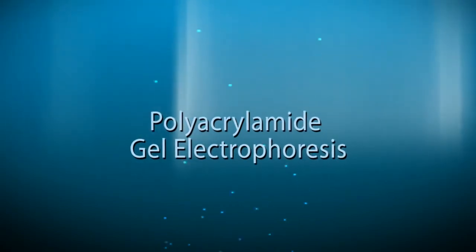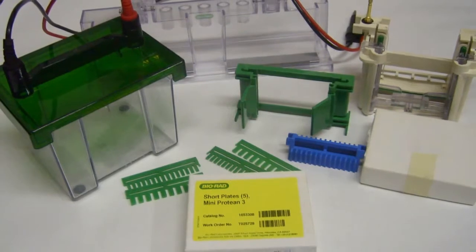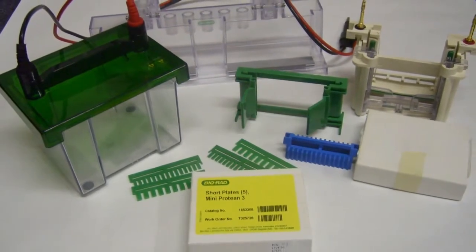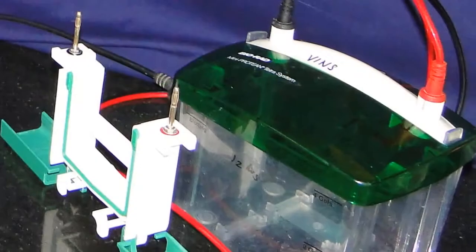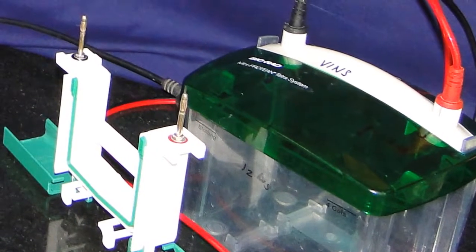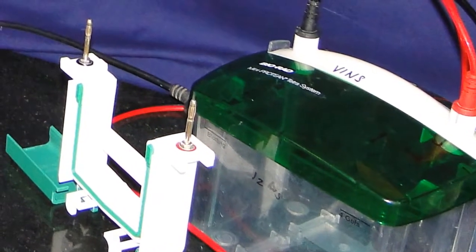Polyacrylamide Gel Electrophoresis. PAGE, or polyacrylamide gel electrophoresis, is a most widely used analytical method to resolve separate components of a protein mixture based on size.